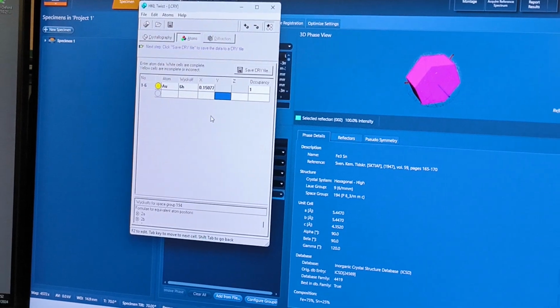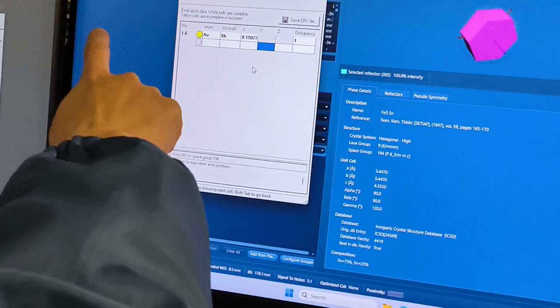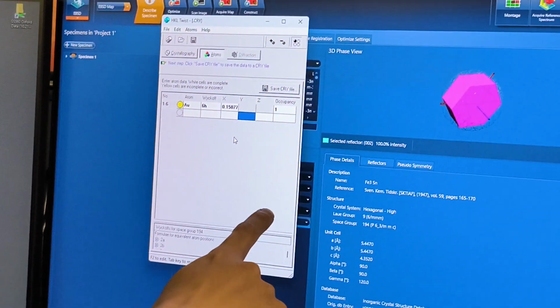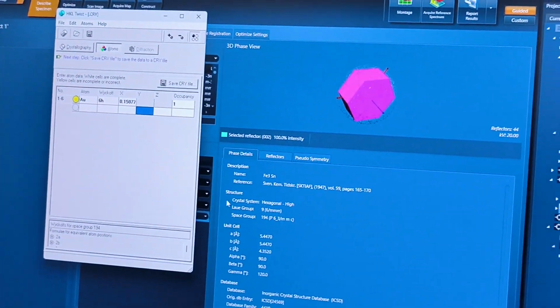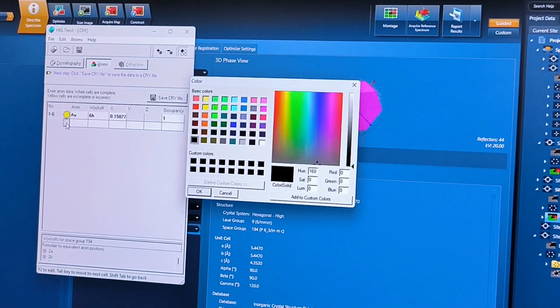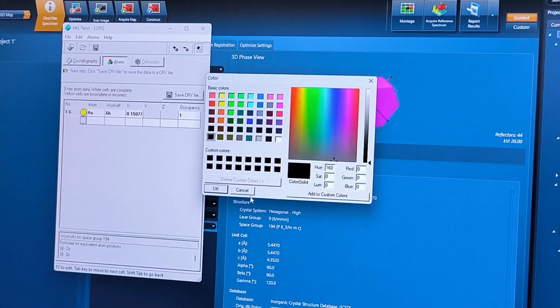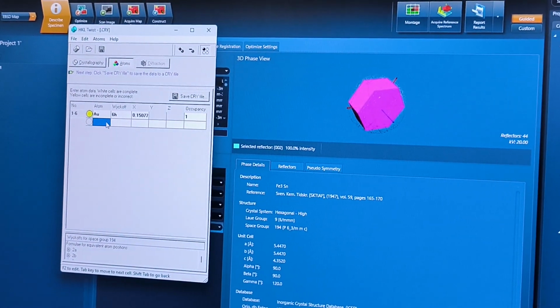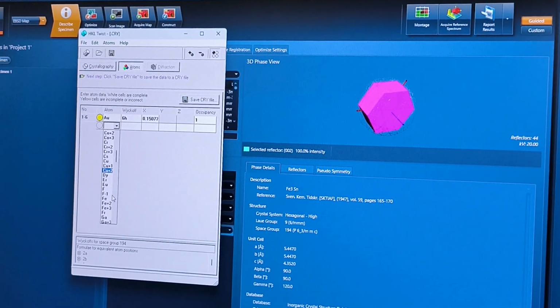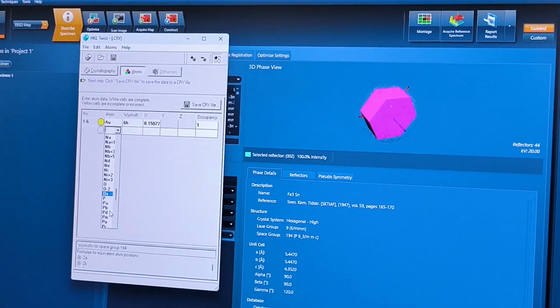When the number changes, the 194 means we must key in this. If you change it to maybe 1, you key in more, right? The group, the space group. Here you can also change the color. So gold, cancel. Next I will put pink, because they are two separate atoms. Later you will understand.